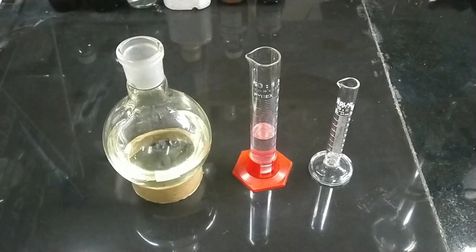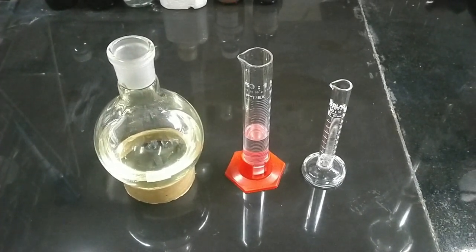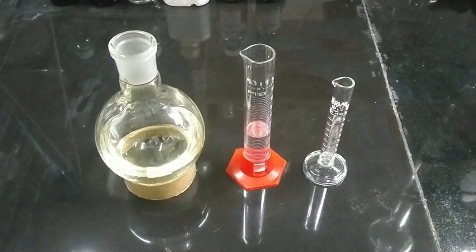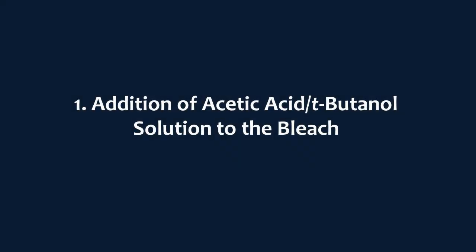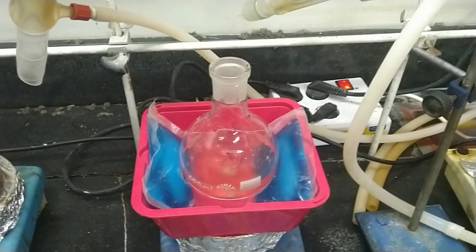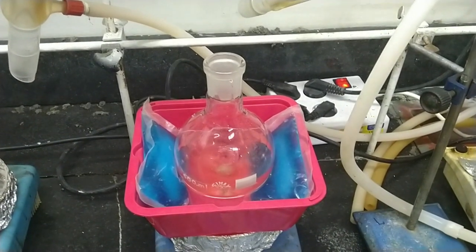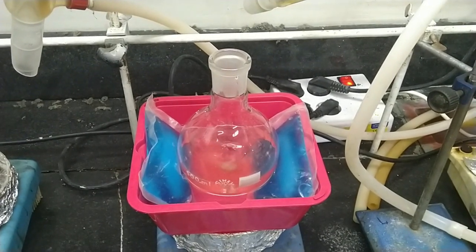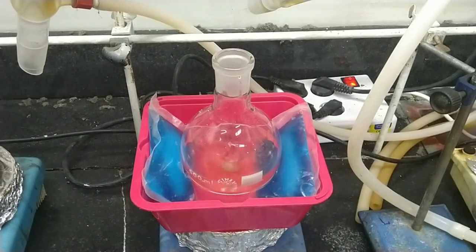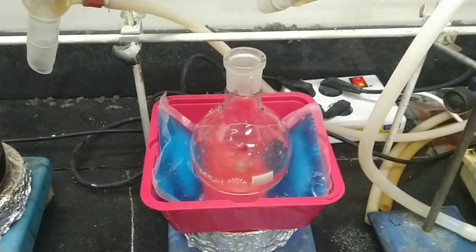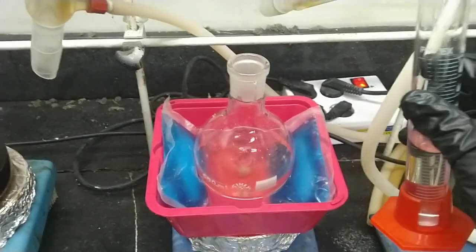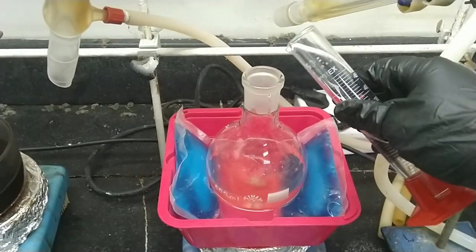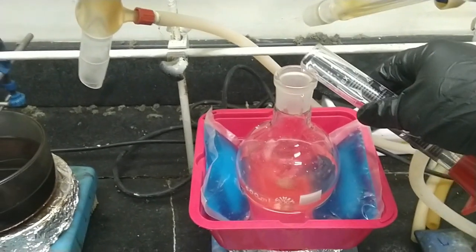After 10 minutes using ice bath, now the bleach temperature is under 10 degrees centigrade. Now I add the tertiary butanol and acetic acid solution to the bleach.